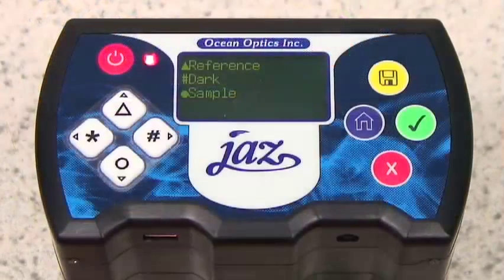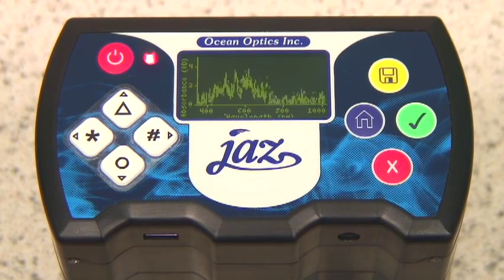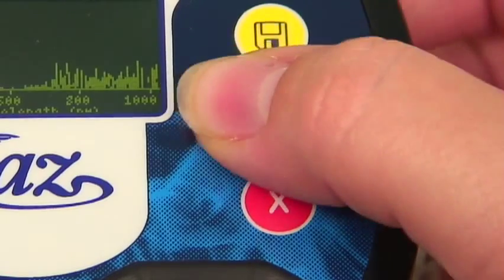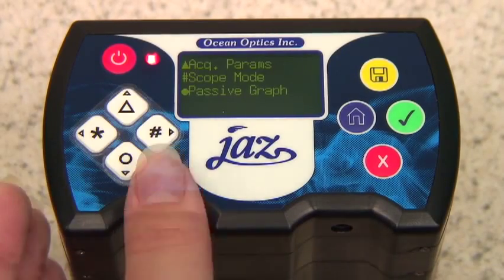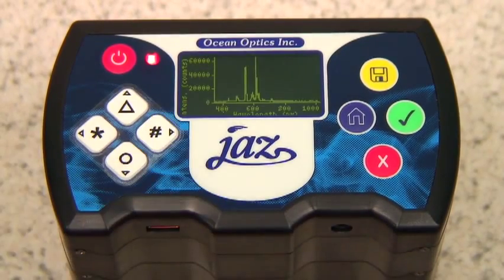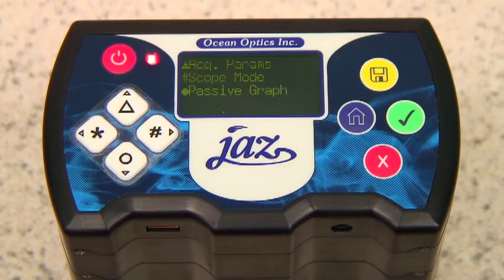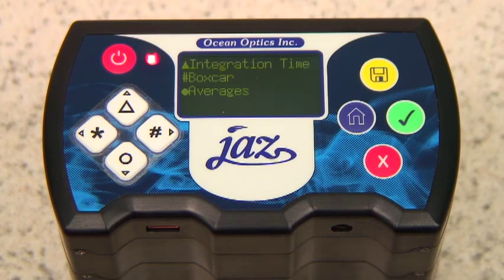You should see the same screen again, but this time with the choice of sample. Press the circle button and you will see the spectrum just as you would in Spectra Suite. In order to get to scope mode, return to the main menu by pressing the blue home button. Once there, select Tools, followed by Manual Control. This should lead you to scope mode which, once selected, will produce a spectrum. The red X button will return you to the previous screen where you can select acquisition parameters — allowing you to tailor your graph by changing integration time, boxcar, and averages. The integration time can be changed manually or automatically.